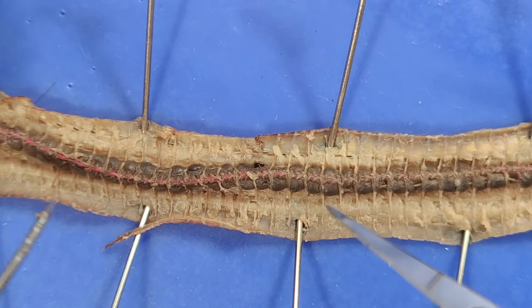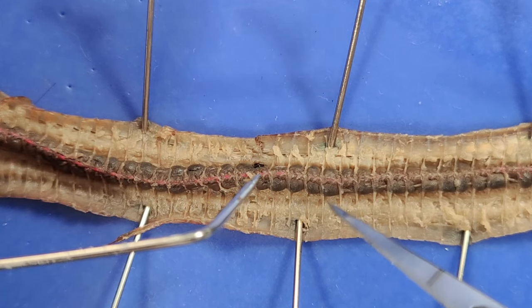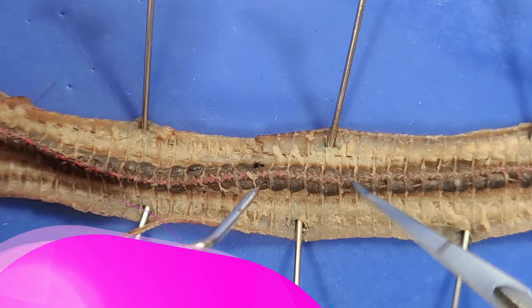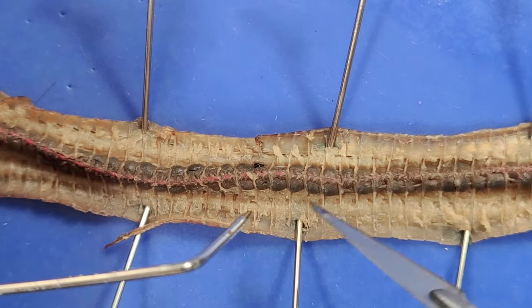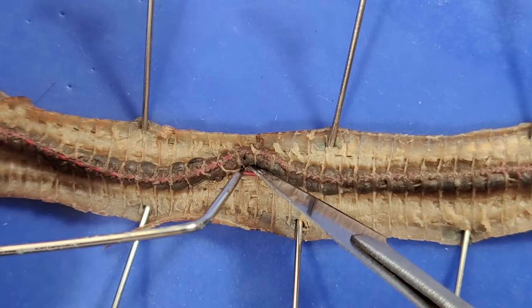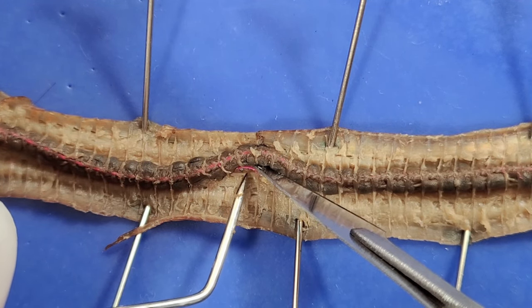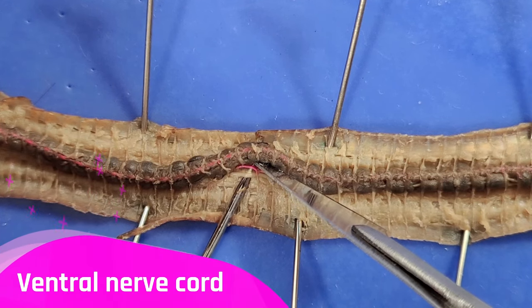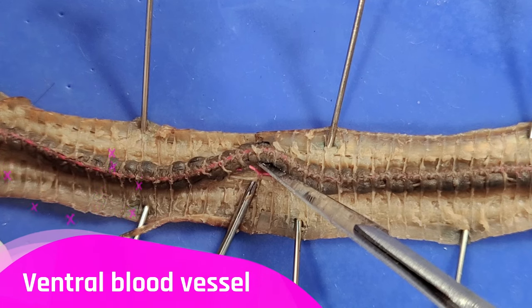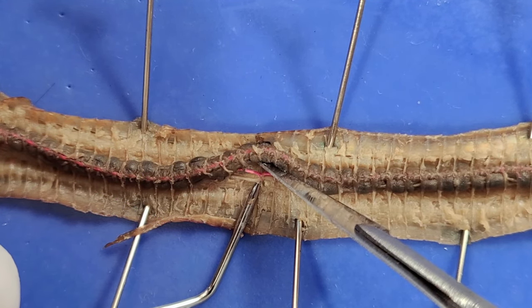Going back to the intestine, you can see this large pink thread that runs along the dorsal side. This is a dorsal blood vessel, and it's responsible for carrying blood to the front of the earthworm's body. On the other side, you can see two threads — the white thread is the ventral nerve cord we saw before, and the pink thread next to it is the ventral blood vessel, responsible for carrying blood to the back of the earthworm's body.